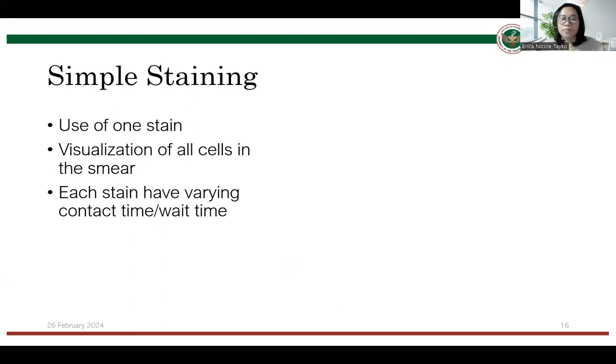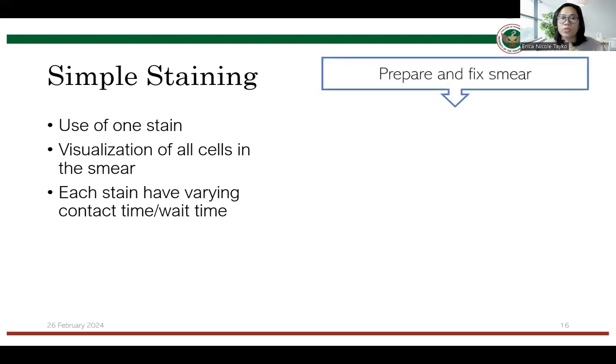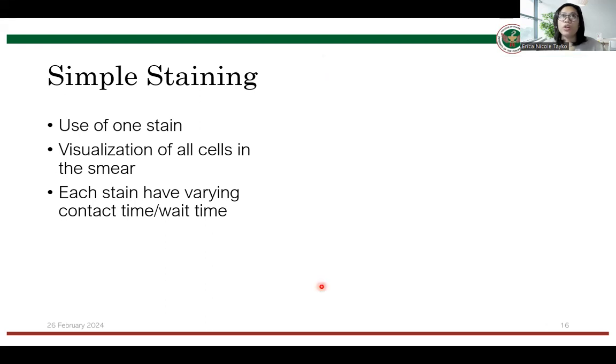The basic stains that you know, which are also used with the other staining techniques such as gram staining, acid fast staining, your carbol-fuchsin, your safranin from gram staining, or spore staining, when they are used alone, as a standalone stain, that's when you employ simple staining.